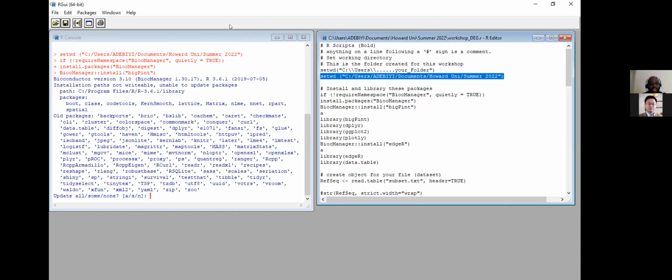So the first thing you want to do is, let me also, let me see, because there's a file that you also have to put in your working directory. Which file? I'm about to put it on the chat so you can download.